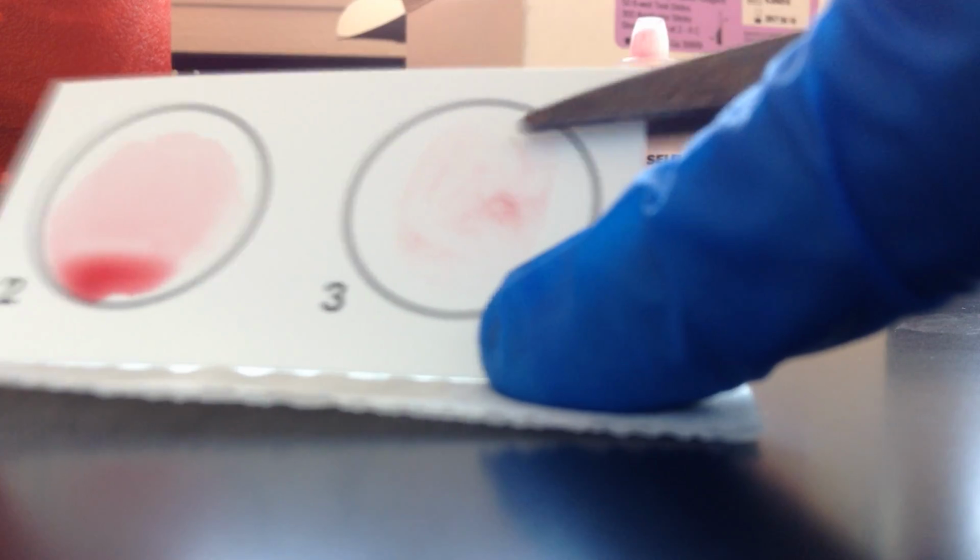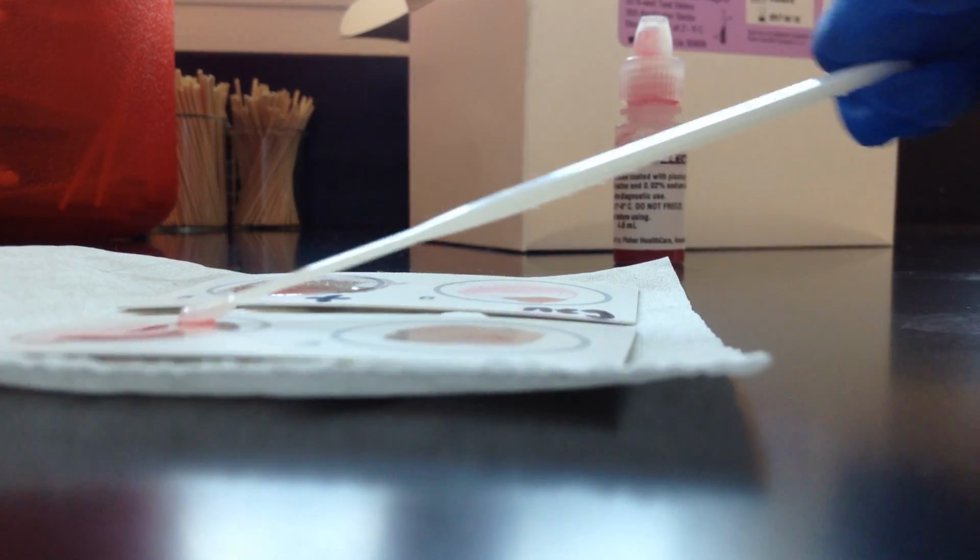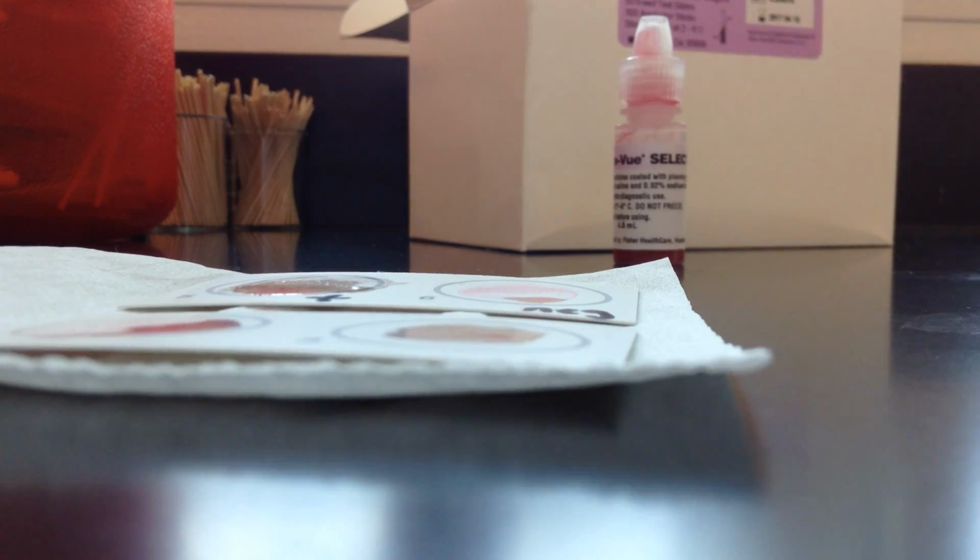And my other test result has still got a little too much liquid on there, so I don't know if we're going to get a good look at that here. But suffice it to say, once it evaporates a little bit, you'll be able to see that. You can also go back and mix that around a little bit with a plastic loop to see if you see that result here. And I'll do that a little bit more here. I just have a little too much reagent, and you would dispose of those, of course. Yeah, here we go. You would dispose of those in the biohazard.